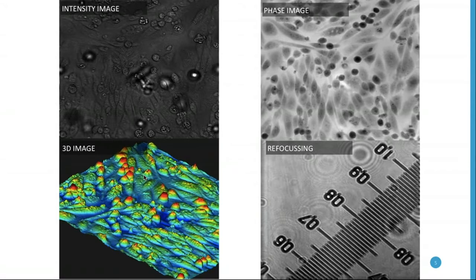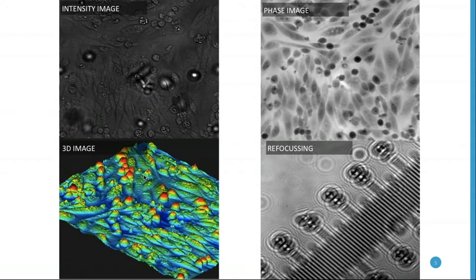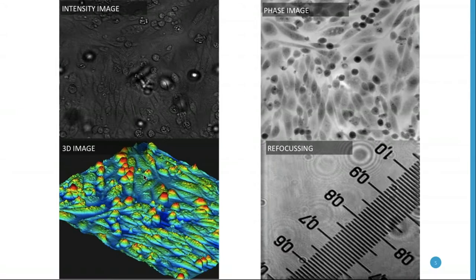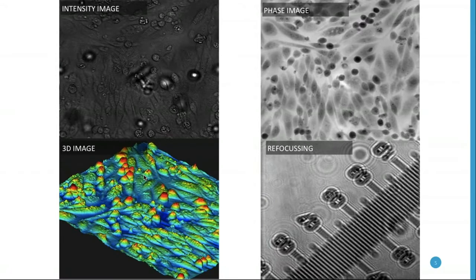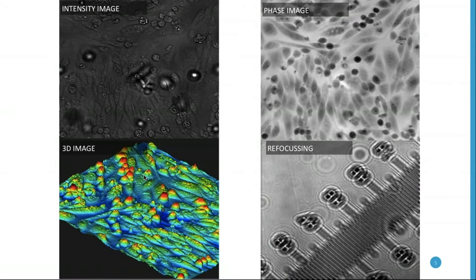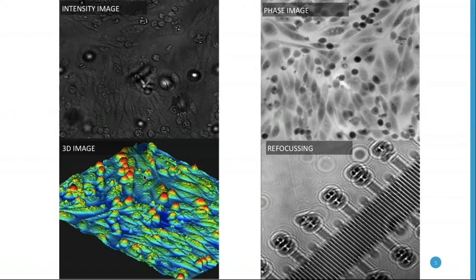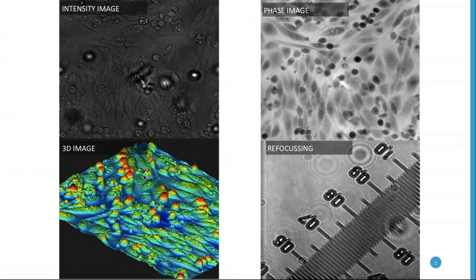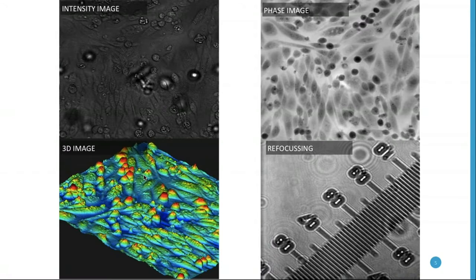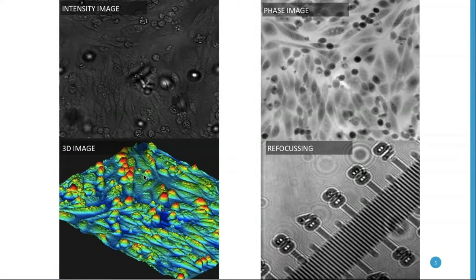Then of course we have the 3D holographic image, and that's really where all the parameters are and what we use in the analysis — a combination of all three images. A very important part is that because we are taking images of a 3D volume and not of a 2D flat surface, we are able to refocus all the cells in the field of view, as you can see in the small video playing in the bottom right corner.